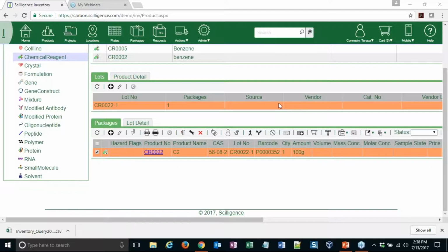So it's specific. The integration to talk to the robotic systems, do we have to build it, or do we have APIs? We use APIs for a lot of integration. I'm not sure for the robotic systems, so I'm sorry, I'm not 100% sure on the answer to that. Obviously, we have to set it up specifically for your workflow.